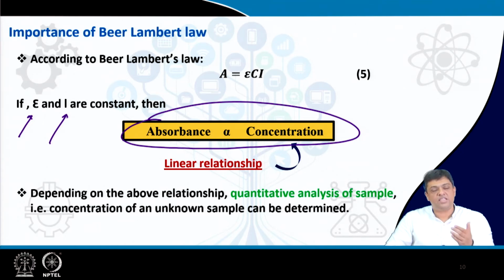And if that is the standard curve which you have obtained, after some time if you perform the same measurement for an unknown sample where the initial solution or the fluid in which the absorbing material is dispersed is the same, then you can extract the information about the concentration of the absorbing material in an unknown sample.